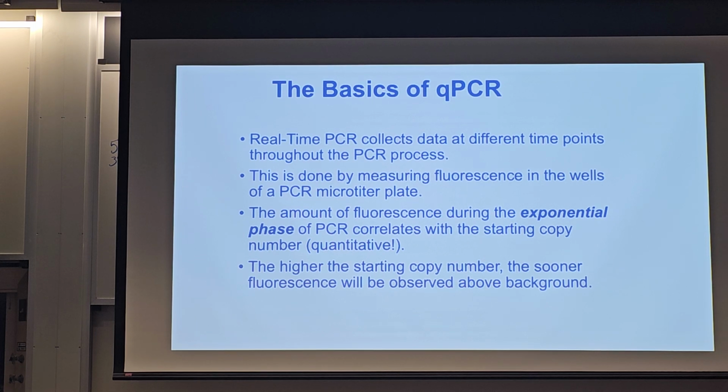So what is the definition of a copy number? Oh, the definition of copy number? Copy number of a gene? So what we're really thinking about is, for example, for our experiment where we're looking at RNA, how many copies of that messenger RNA did we start with that then got converted to cDNA, and then we started doubling. So we're back calculating how many original cDNA molecules we had, and therefore the number of RNA molecules that we have. Okay, does that make sense?